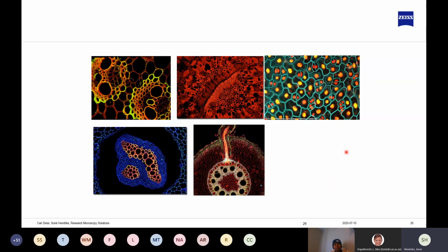Now, this is something that I will cover in the sample prep or in one of the discussions on Friday. We will talk about multi-channel fluorescence imaging and also spectral unmixing with the confocal microscope. The best system for looking at autofluorescence samples is your confocal, because the confocal detector allows you to separate these signals coming from the different organelles or dyes or areas of interest.